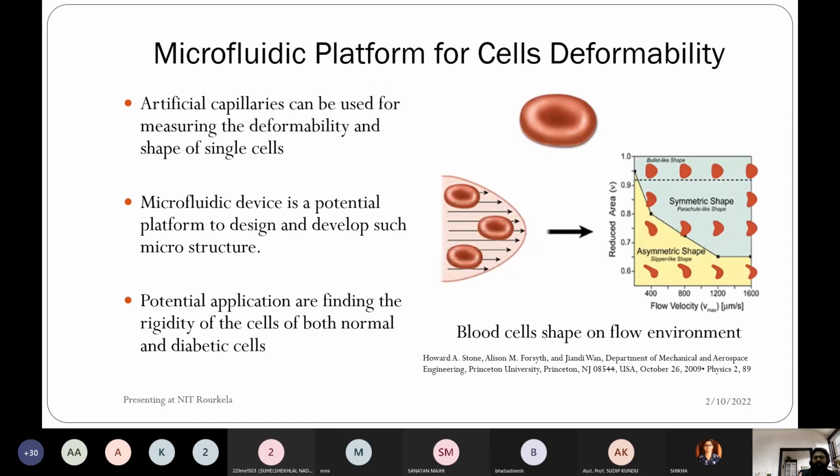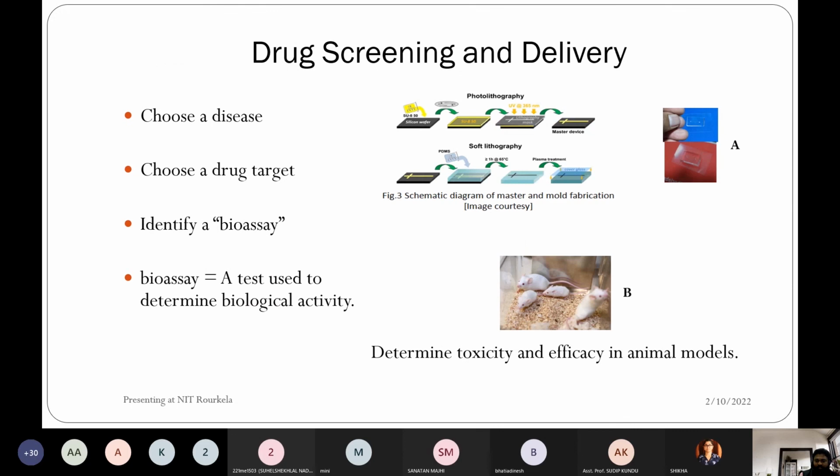There are different other applications we can use it for, for example deformability measurements. With the hyperimaging system you can see the imaging and do single cell analysis. A single cell flows through a microchannel at a desired flow rate, and we can see what stretch it undergoes due to the pressure of the flow. That can be carried out using the hyperimaging system, not the absorption flow cytometer which we use for characterization. There are also other applications related to microfluidic aspects and other things.